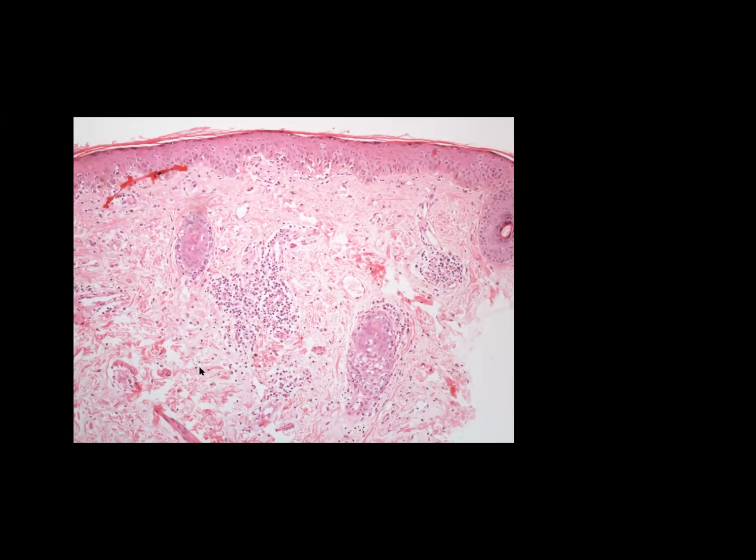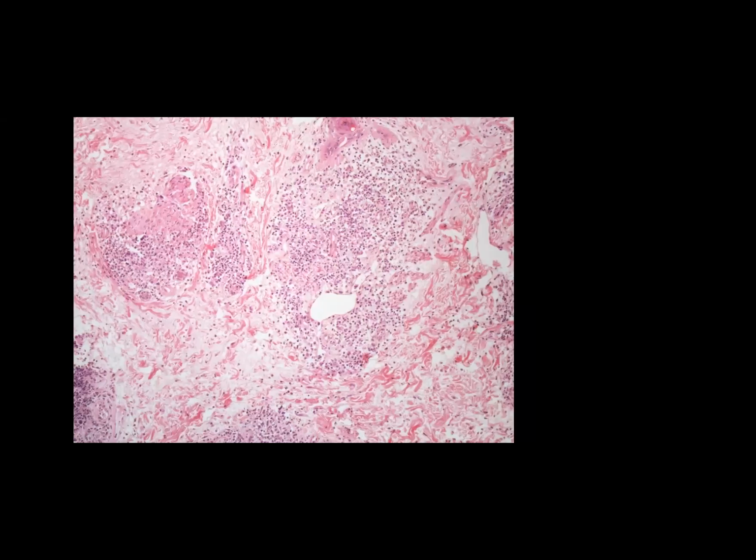You can also appreciate that there is separation of collagen bundles, and this is because there was an increased amount of mucin. So all these features were rightly fitting into lupus erythematosus. Again, I saw a very nice lymphocytic infiltrate around the appendages, another feature suggestive of lupus erythematosus.